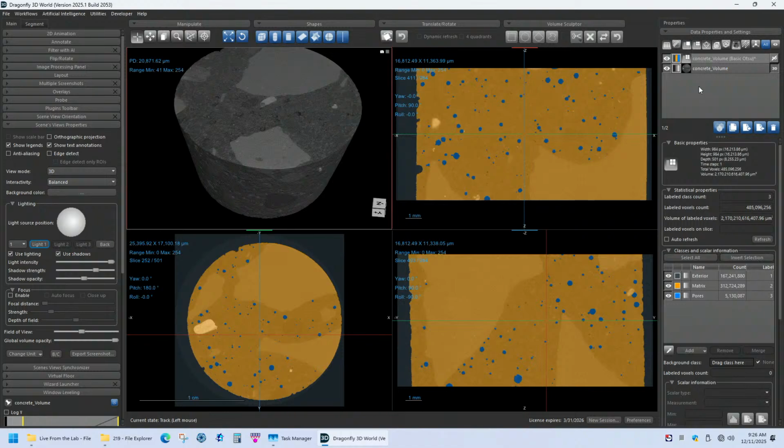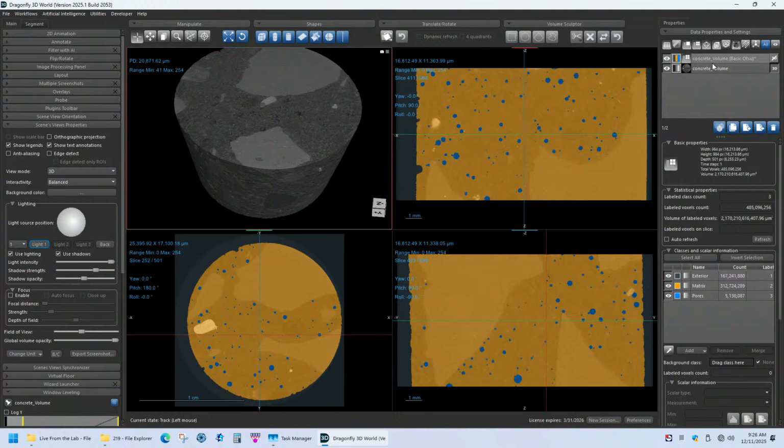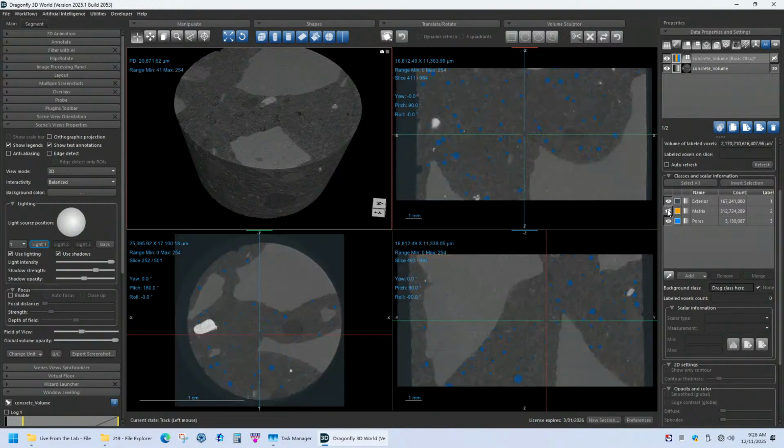But yeah, there's different levels that you can add to this. If I click on it, it added this little group now. And it looks like the group has an icon of like three distinct stripes. Right. And if you scroll down, we can see that it has the three different volumes that it added, so you can turn them on and off.